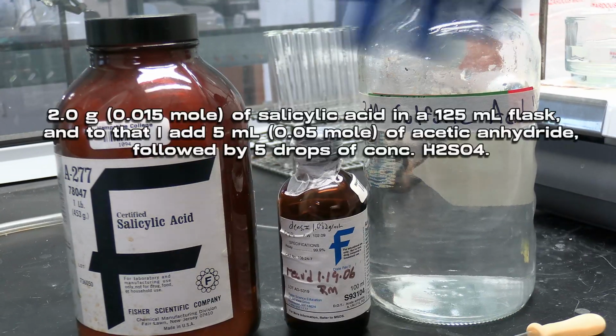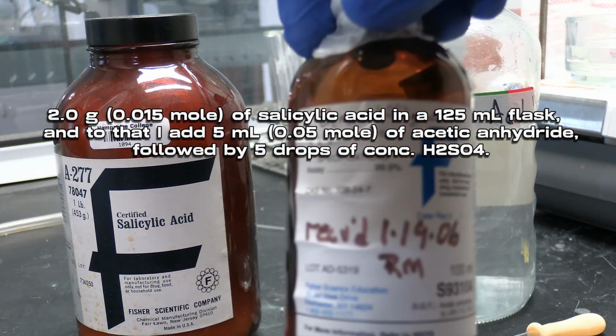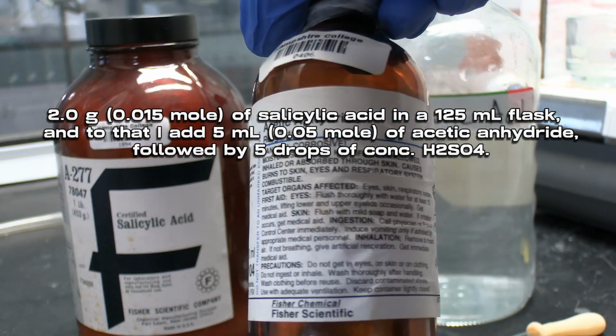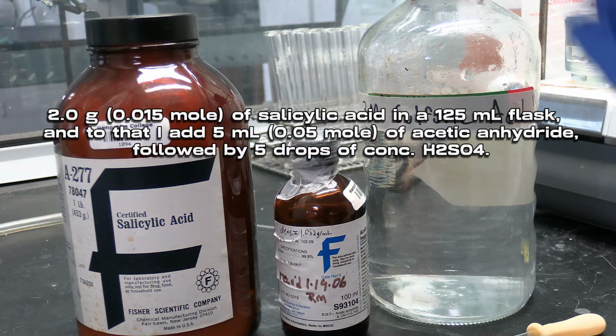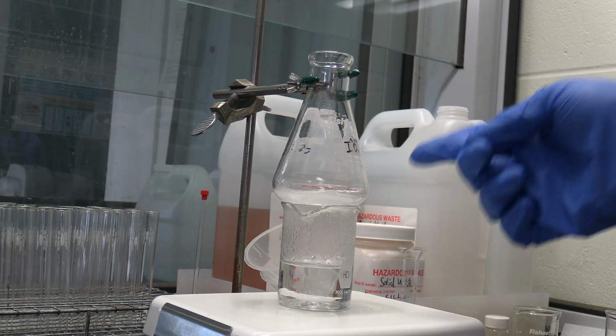The procedure calls for 2.0 grams or 0.015 moles of salicylic acid in a 125 milliliter flask, and to that I add 5 milliliters or 0.05 moles of acetic anhydride, followed by 5 drops of concentrated H2SO4, or sulfuric acid.